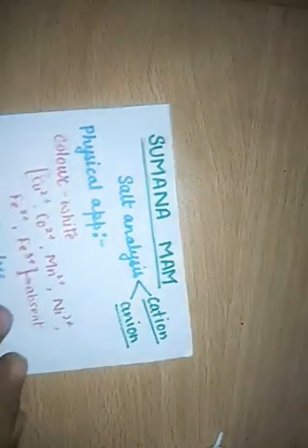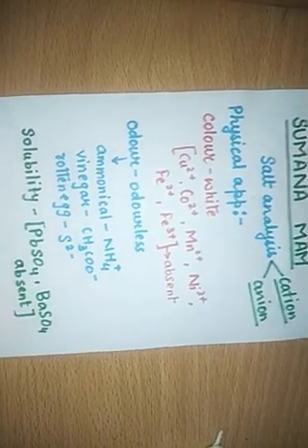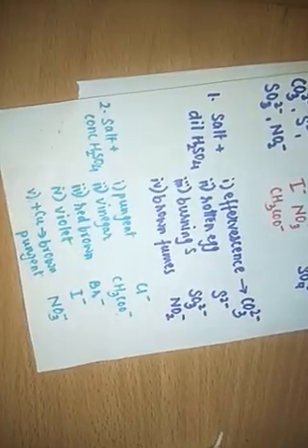So till now we have studied about the confirmatory. So what was the process? We have seen whenever we are getting the salt, we'll see the physical appearances of the salt, and then we will do the preliminary test, dilute acid, concentrated acid, and then independent for anions. Then we have seen the confirmatory tests, right? Now today we will see the confirmatory test for concentrated acid group.